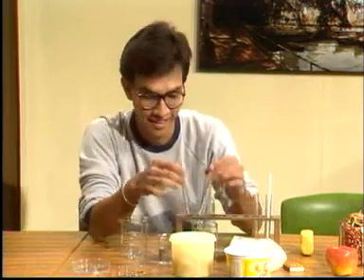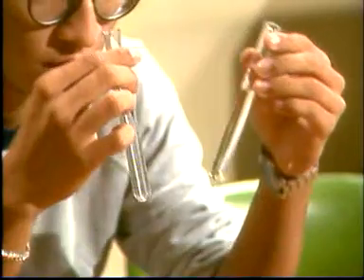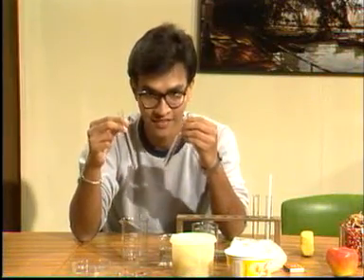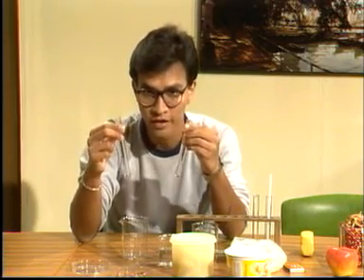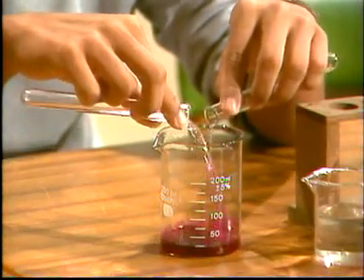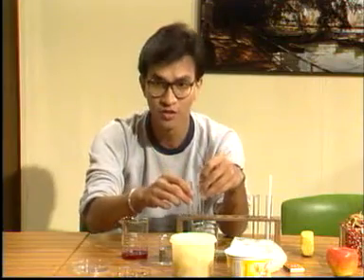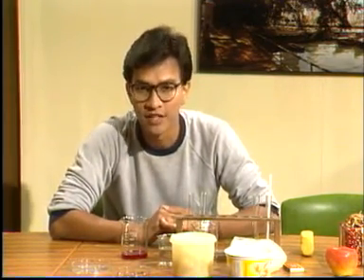Hello there. I have two test tubes of different liquids. Can you tell me their color? Yes, they're colorless. Now I'm going to mix them. Watch very carefully what happens. Did you notice something? Yes, a change. There's a change in color.